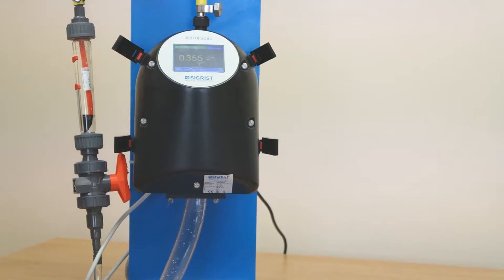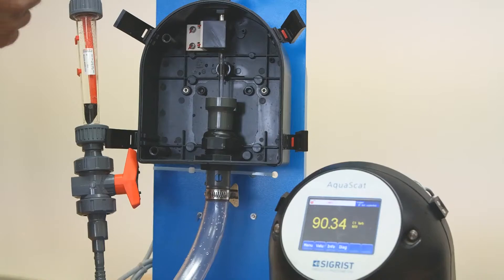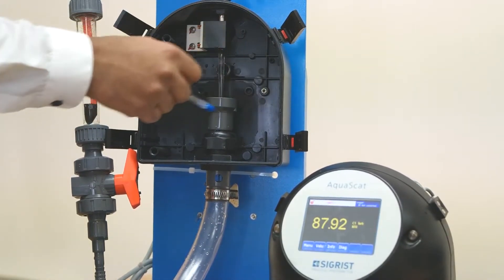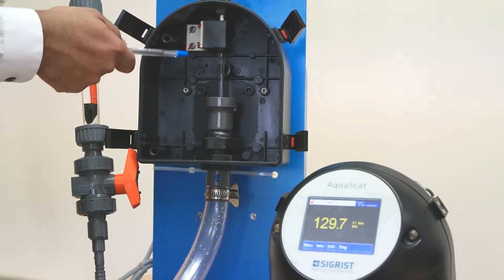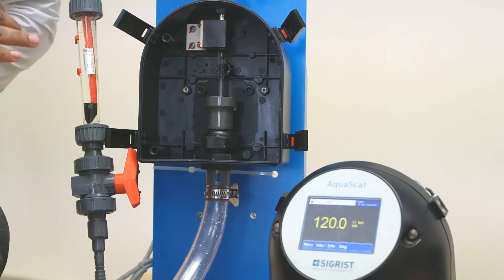Now let's take a look inside. As you can see, there's a steady stream of water from the top to the bottom, none of which is touching the instruments. The light from the instrument is received by the receiver at the back. Truly non-contact — this eliminates cleaning.